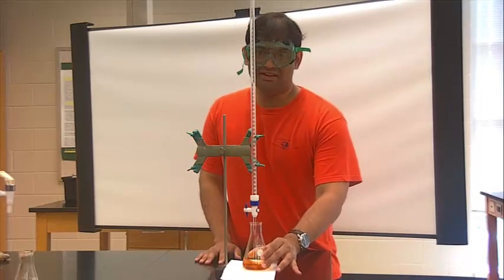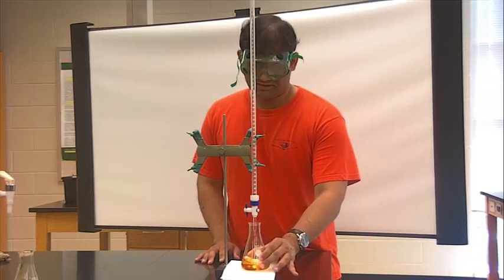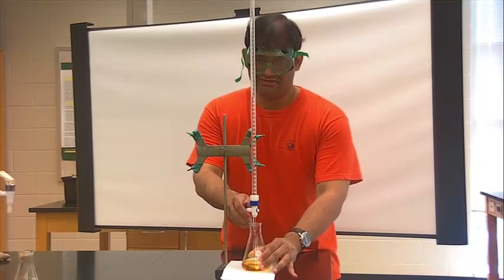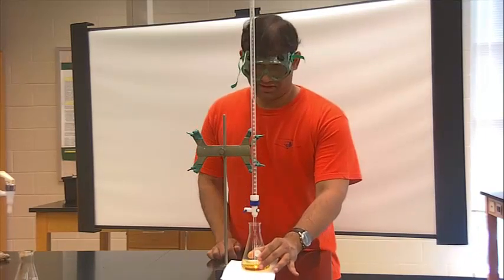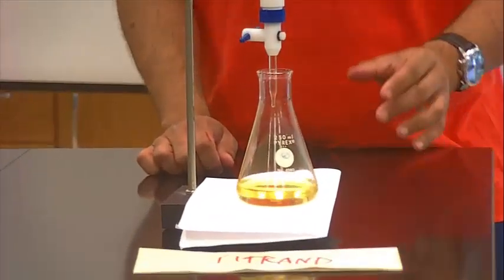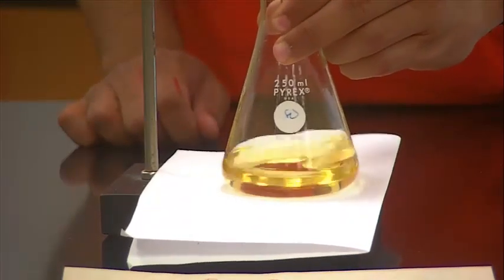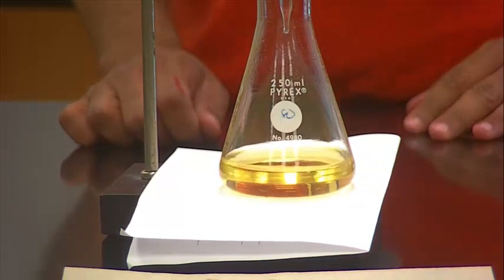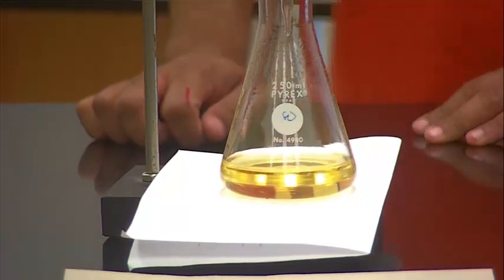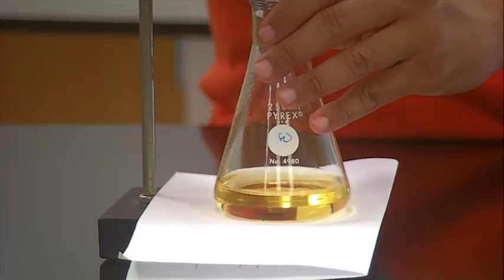Okay, you notice my color is beginning to change. And I'm almost at 2 mils. Maybe I'll just go a little bit before. Okay, here we go. I am roughly at 2 mils. You see that I still have that very, very faint yellow tinge. And now I've got to be careful here. I want to go drop by drop until I remove that yellow tinge and it becomes completely colorless. So now I'm going to go drop by drop.